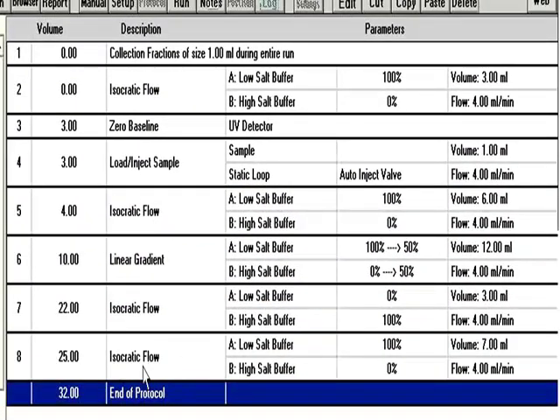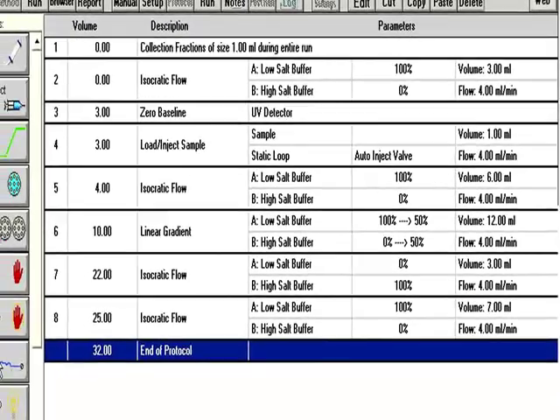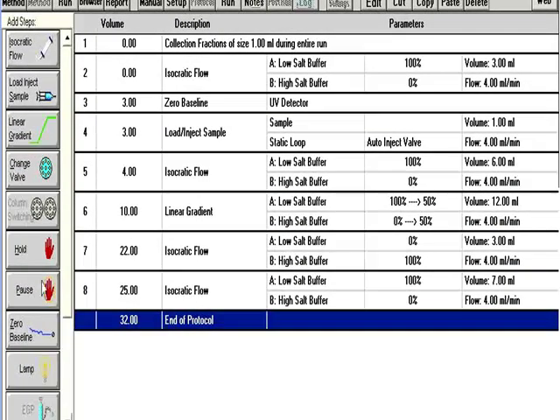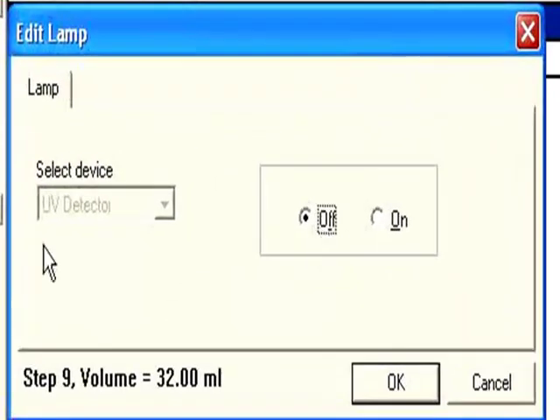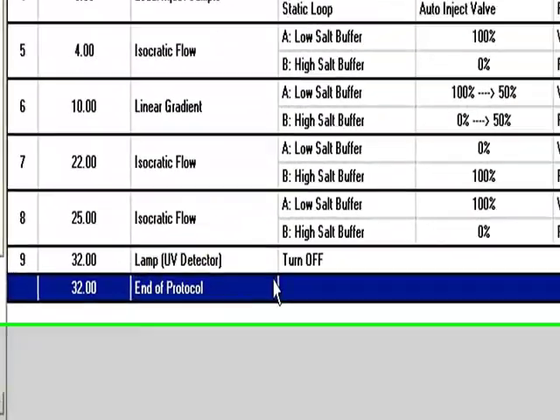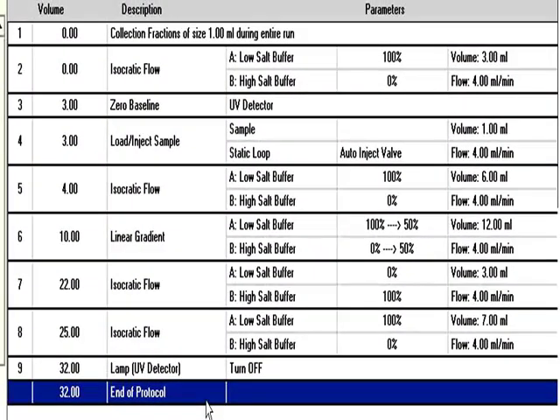And the final step, which isn't in the pre-programmed protocols, would really be to turn off the UV. So to turn off your lamp, you can click on these buttons here to add steps. So lamp off, and there we go. Now our lamp is off. So we're all set to go. We're ready to run our protocol.